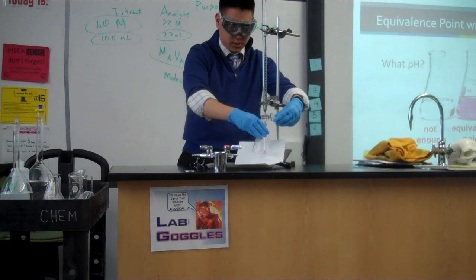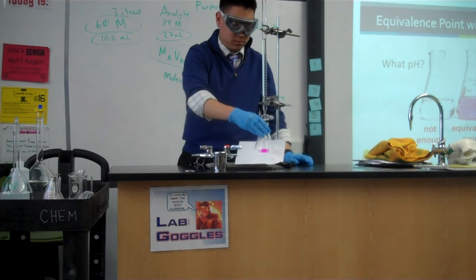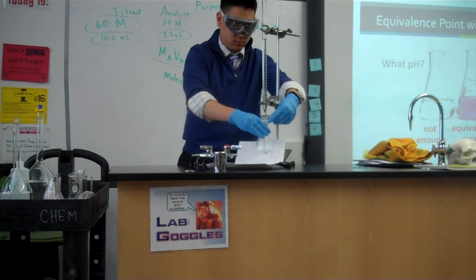Now, it is important to actually stir it, because if not, it'll look like the pink stays there. So we might think, oh, we're done. We stop, but then as it dissipates, as it spreads out, as it diffuses, the color starts to fade. So you want to make sure to continuously agitate it, being careful of the burette tip. You don't want to break the tip. Okay. So we're going to continue in a dropwise fashion until the pink starts to stay longer.